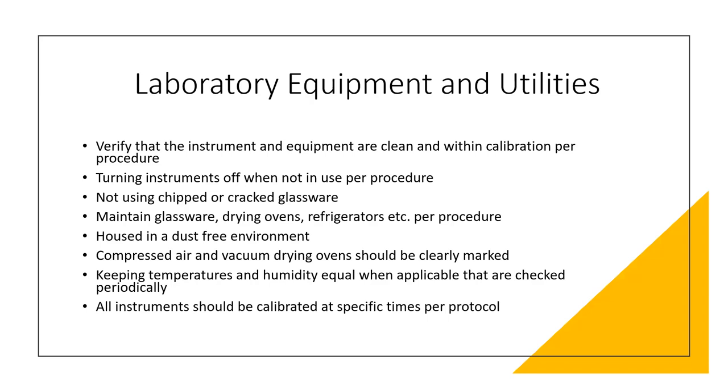So you want to make sure that you can rely on the equipment you have to do the volume of testing that you need to do, to be able to get product out the door, to make sure that we are testing correctly and that we are getting results that are accurate. Again, as we went over before, if we're using unclean glassware, that's going to render inaccurate results. It's the same thing with the laboratory equipment. If our laboratory equipment isn't cleaned properly, is not validated properly, and the preventative maintenance is not kept up, it will also render inaccurate results. So it's kind of a twofold situation: we need to make sure that we are using our equipment, and that it is up to date and cleaned properly.